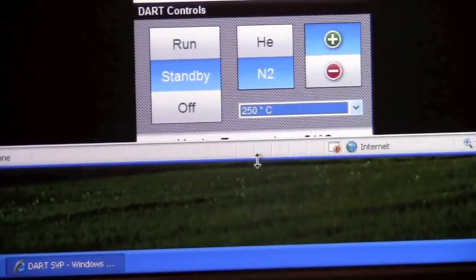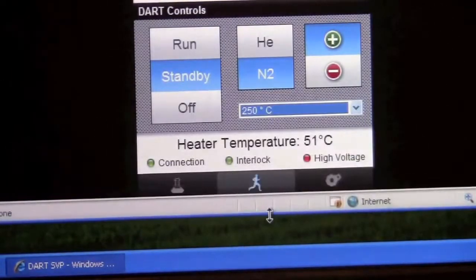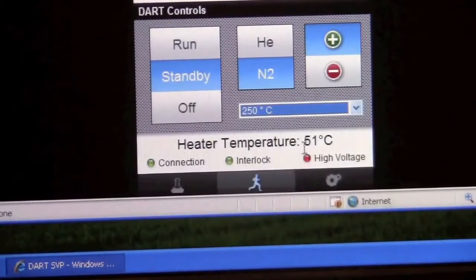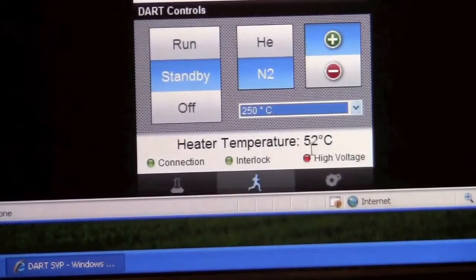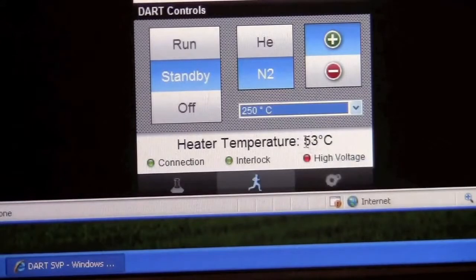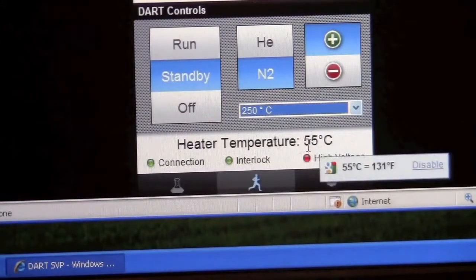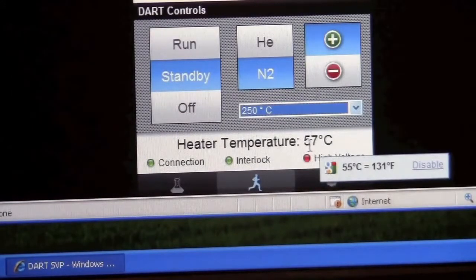It will start ramping up the temperature. And we need to wait for it to get up to the target temperature.